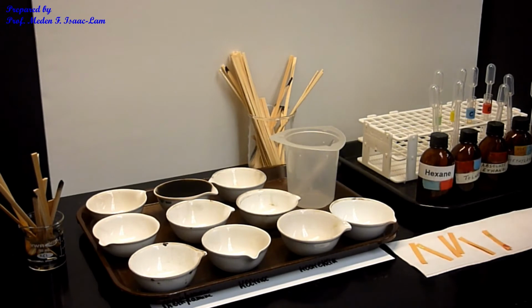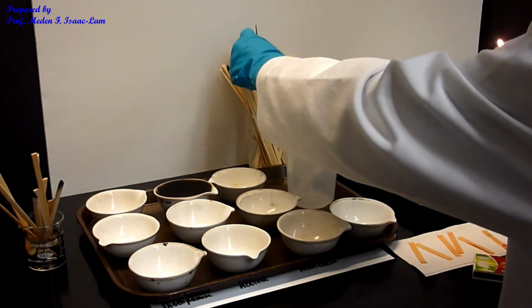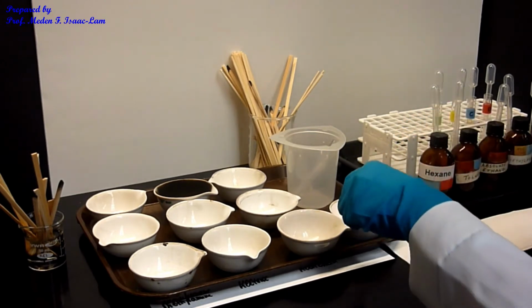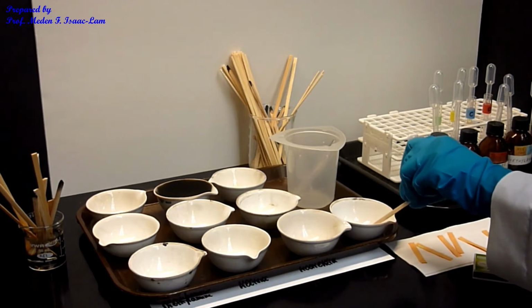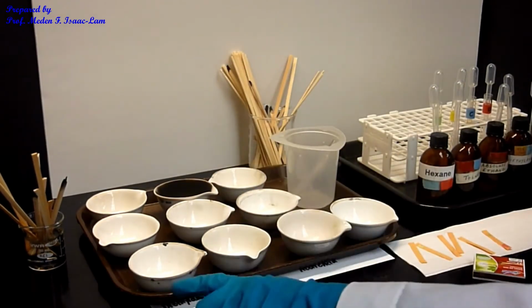So now flammability of that sample should be similar to the result earlier. Okay, so I don't see any. It's not flammable. All right. So that's done. That's A, B, C, D.